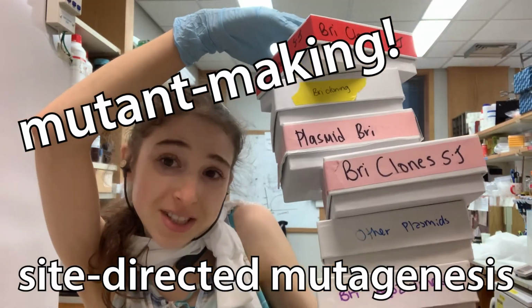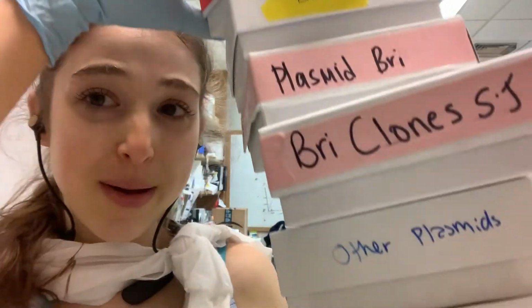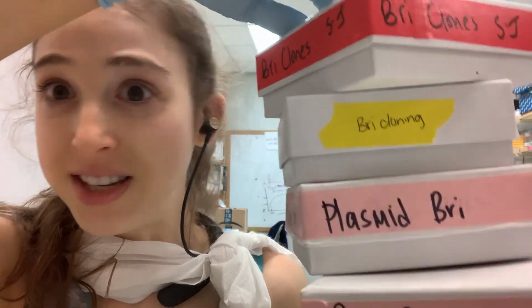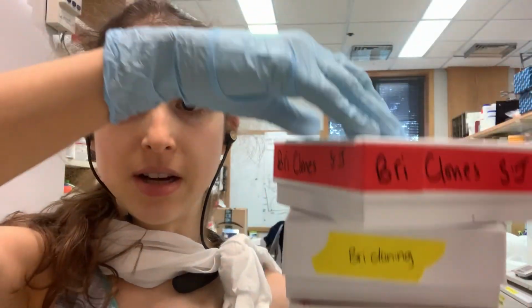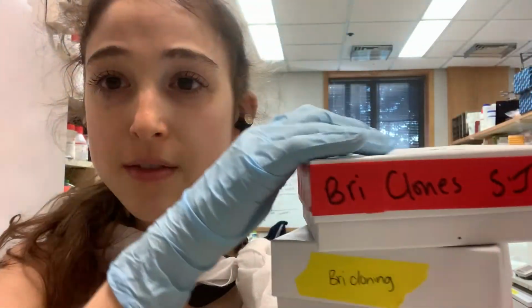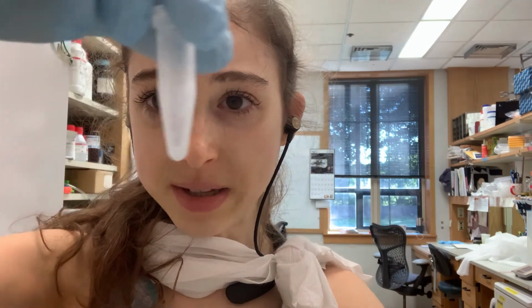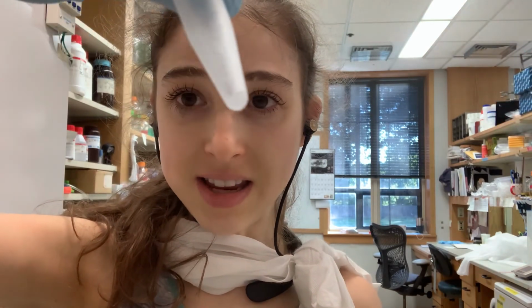Mutants! Many mutants! Don't worry, they're just protein constructs. So, I've talked a lot about how I've done like 750-something SDS-PAGEs, but I've also made a ton of protein constructs, so these are different versions of proteins that I want to make. And in each of these little tubes is a plasmid, a circular piece of DNA that has inserted into it the instructions for making a protein that I want to make.